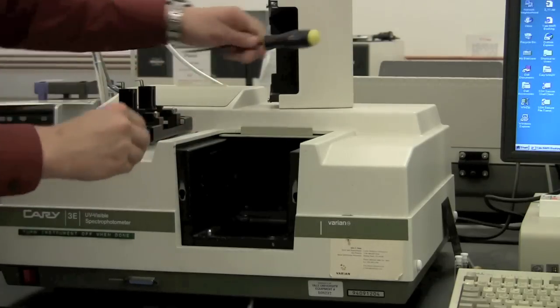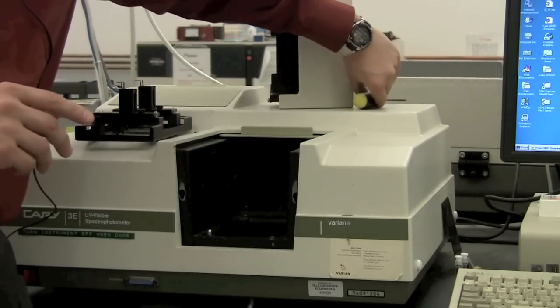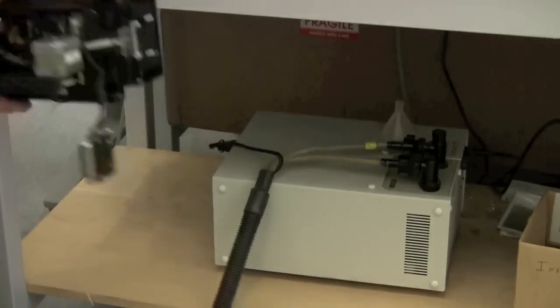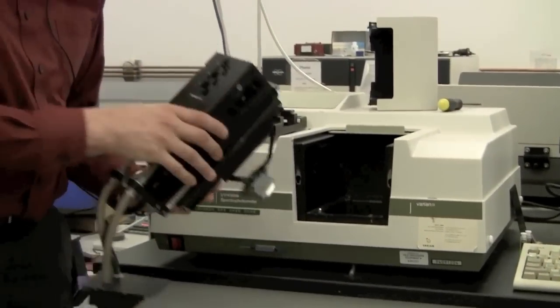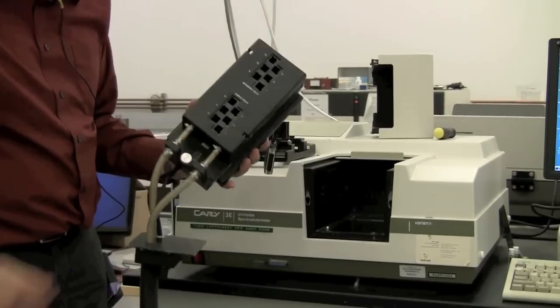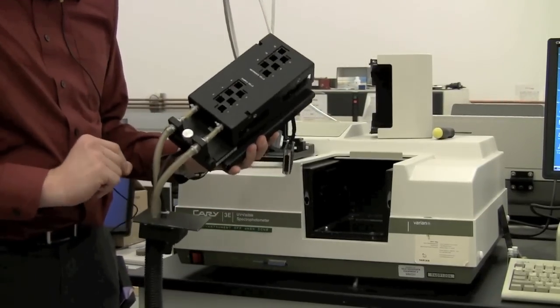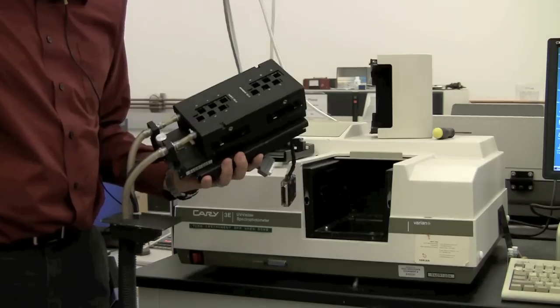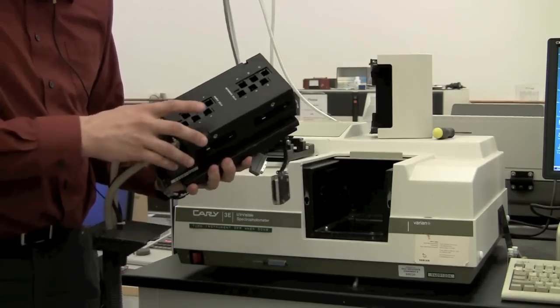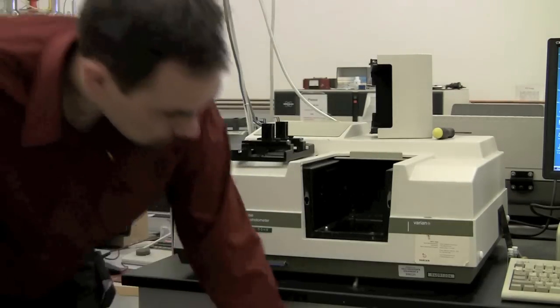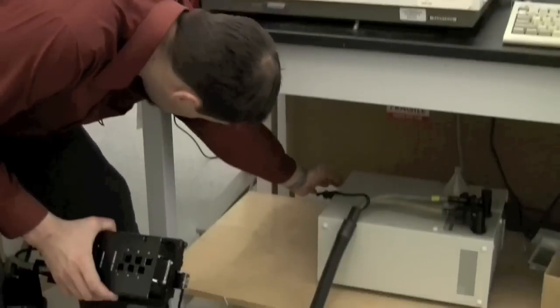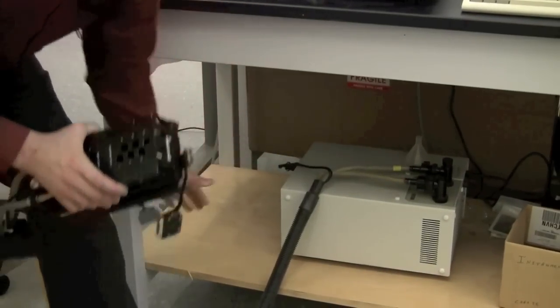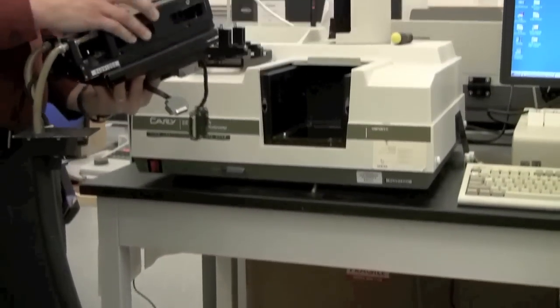Now for temperature-dependent experiments, you can use this sample block here. It can hold up to 12 different samples and it uses a Peltier to adjust the temperature slightly above or below room temperature. If you're going to use temperature control, you need to make sure that you turn on the water circulator. There's a red switch on the front. This provides cooling water to the Peltier device.